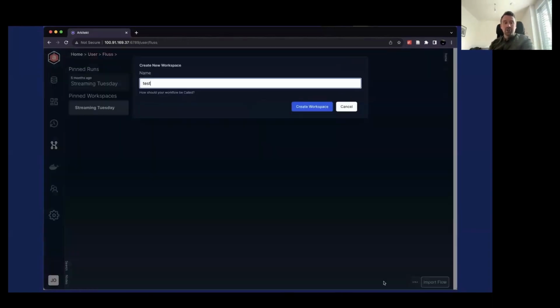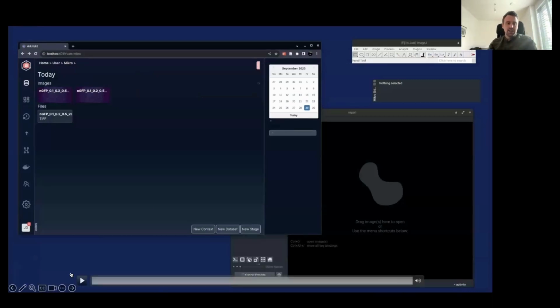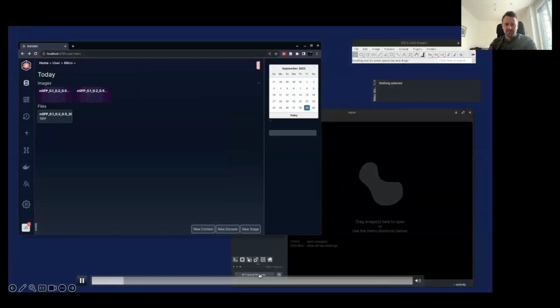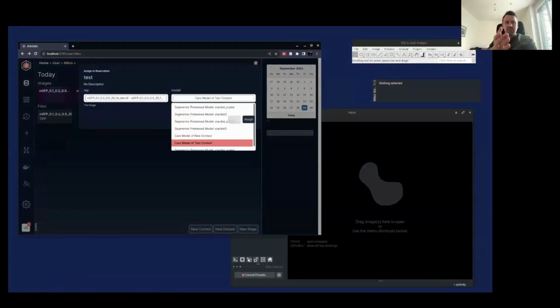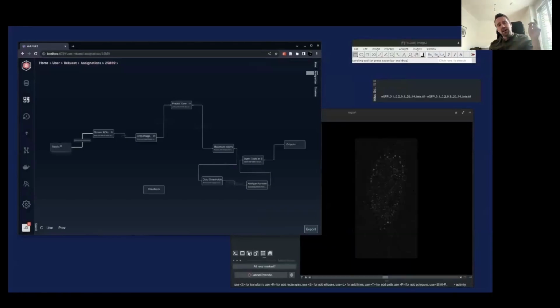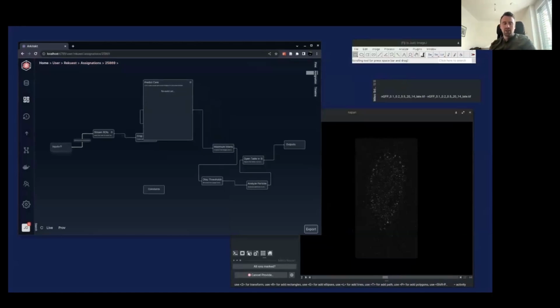And now she can actually run this workflow. What we see here is that she has Napari open on her computer, this 3D visualization tool, and Fiji. These two apps are connected to Arkitekt. You see this lower window down there. It means the app is actively connected. Now she can run this tribolium analysis workflow on the app. She just says which deep learning model for CARE she wants to use. And then Arkitekt starts by sending the image directly to Napari. So we see that open now.